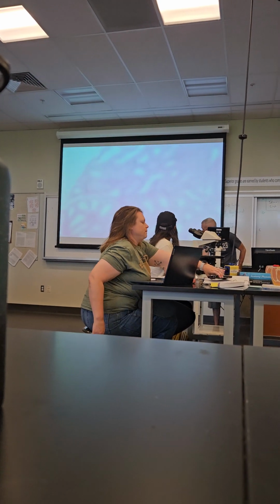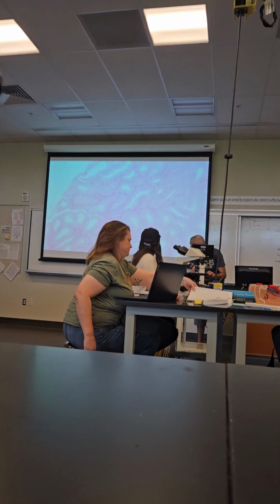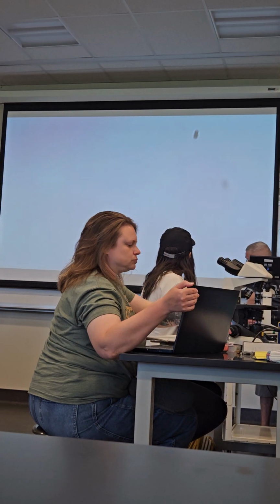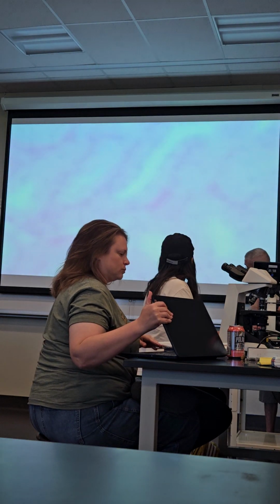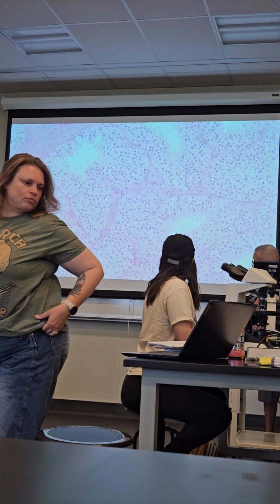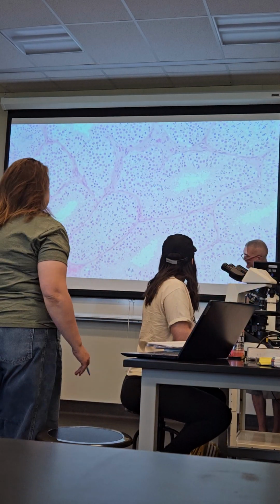Testicular vessels. The testes. More than the field of view. Testes. Yep, you got it. Testis.